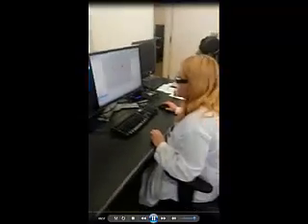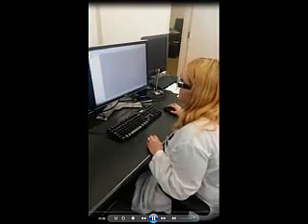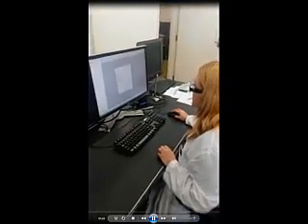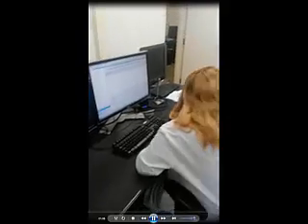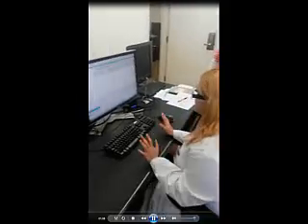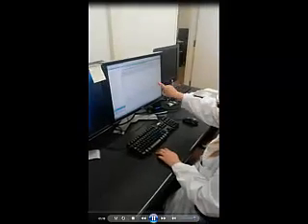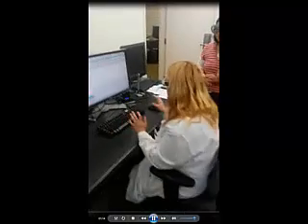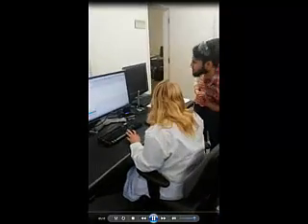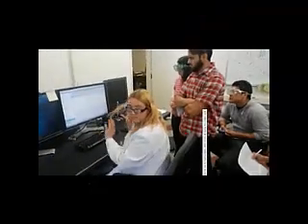The first thing I want to show you is what the standard looks like for today. You've already done HPLC, correct? So you all know what an HPLC graph looks like. Caffeine elutes out at 4 point something. 4.7. This one is at 4.6, but generally it's 4 point something. Beautiful HPLC graph.